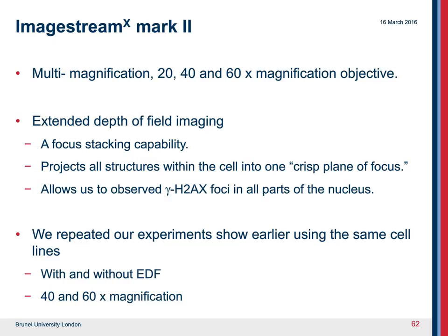So we went back to our original experiments, repeated them to see if we could identify a difference in the number of foci that we were observing. And we did this with and without extended depth of field, EDF, using the 40 and the 60x magnification.